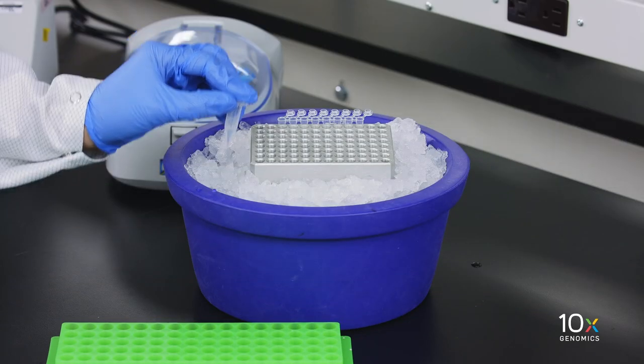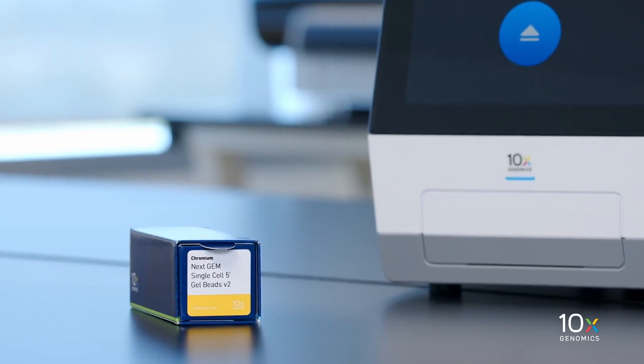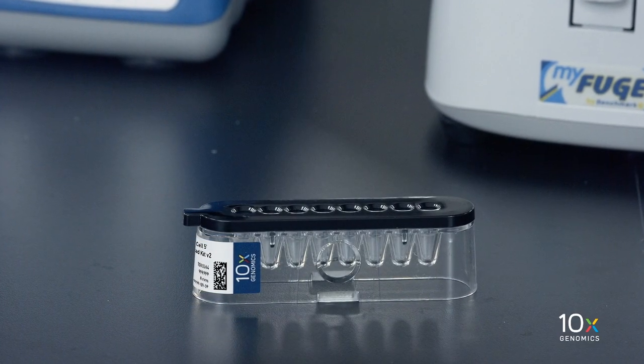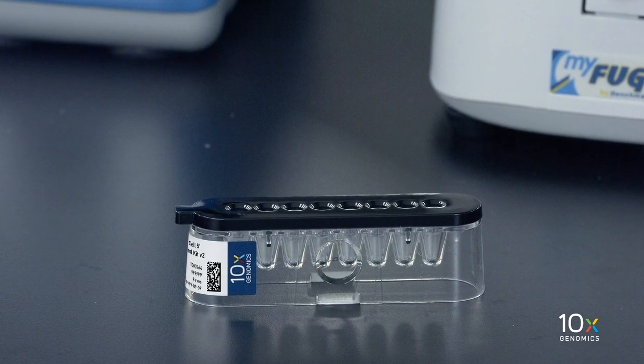We have our single cell suspension on ice. We have removed our gel beads from minus 80 degrees Celsius. The gel beads need to equilibrate to room temperature for at least 30 minutes. We are now ready to prepare the master mix.